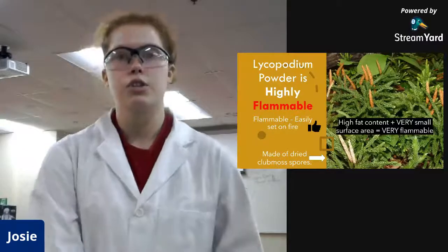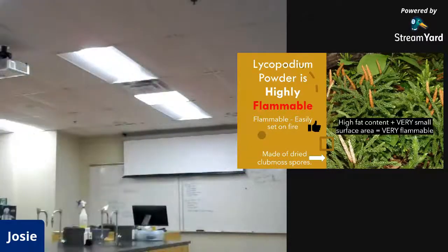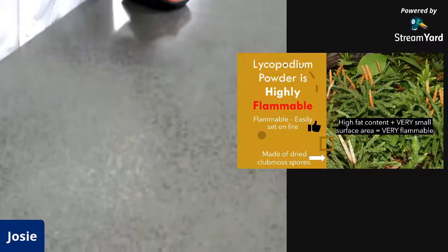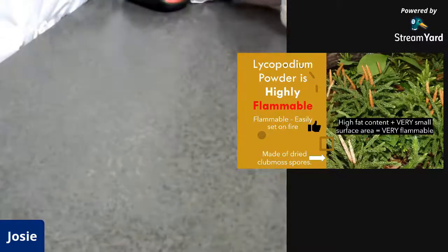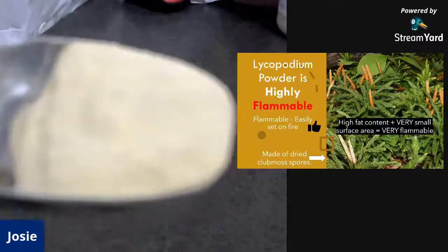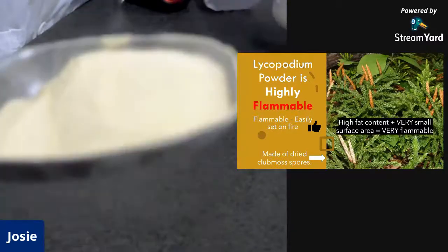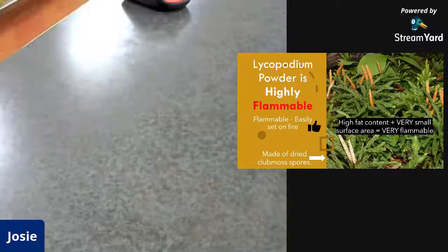If you want, I can show you the powder up close so that you can see it's very fine. It's finer than sand. I don't know how well you can actually see it, but it's a very fine powder. Like it almost behaves like a liquid. It's so fine.